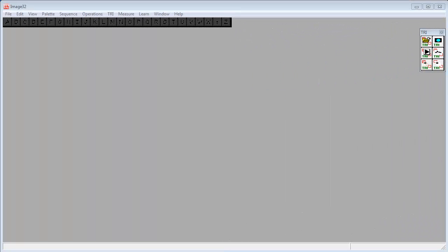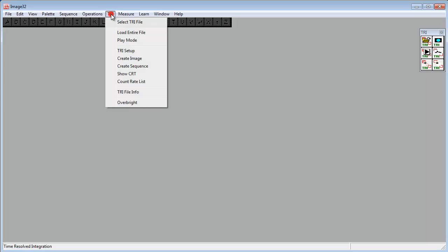Hello, welcome to this tutorial on the TRI menu. We'll start off by just having a quick look at the TRI menu itself.